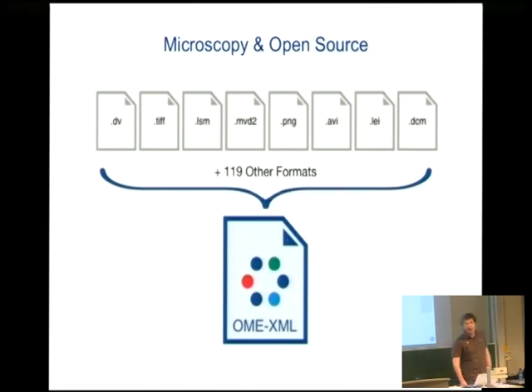But with OME-XML, we can start to build generic tools which can then be used by anyone on any image format.